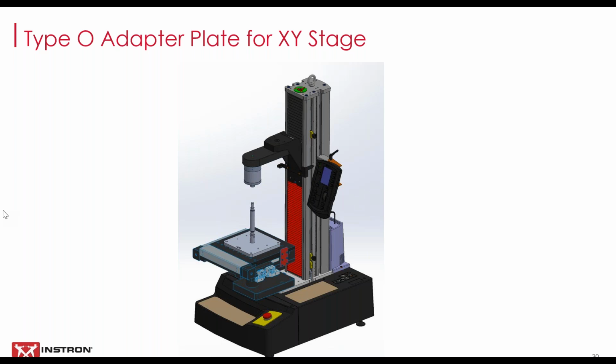Next question that we have. Can different steps within an XY stage method use different data capture rates? Yes. So when using our test profiler option in Bluehill Universal for setting up an XY stage method, you can choose to either use the method's standard data capture scheme, or you can override this data capture scheme for each step within the test profiler method. From there, you'll be able to select your normal data measurement or intervals as you would normally in test profiler.